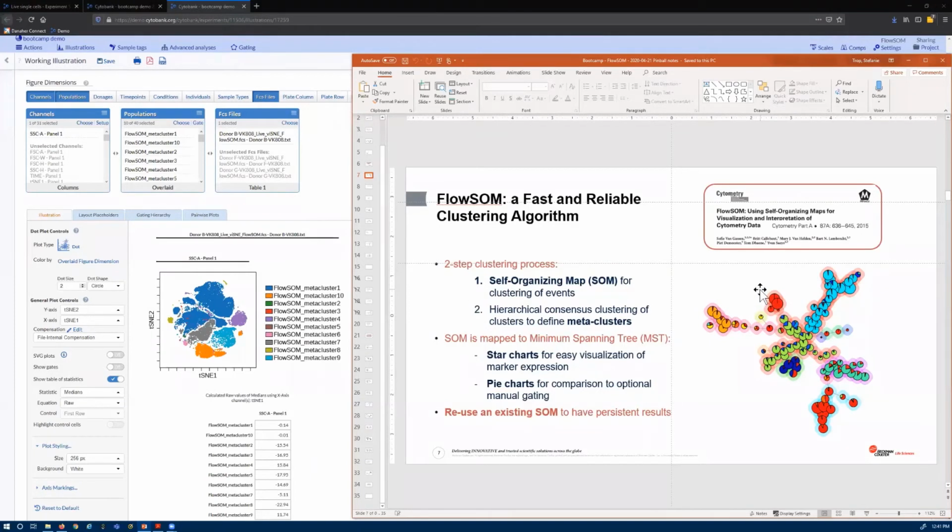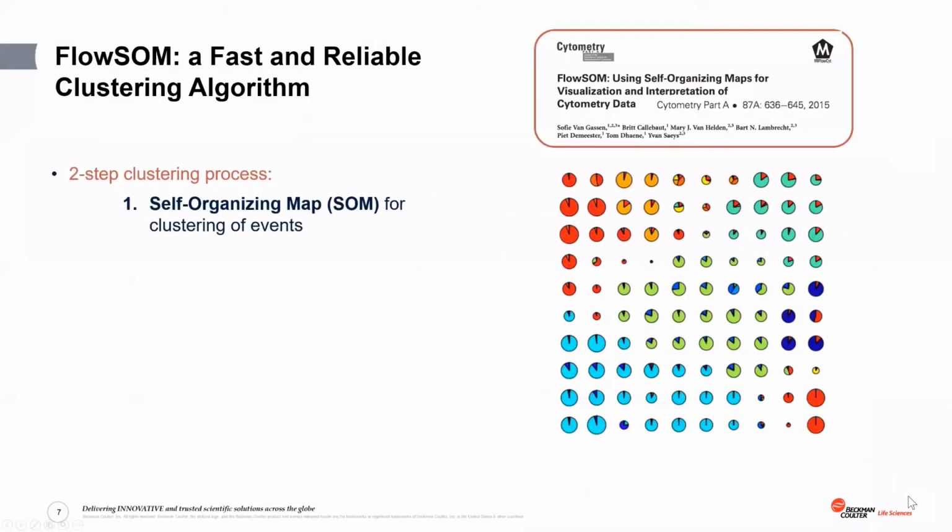So the cluster number is how many of those you tell the algorithm to divide your data into. And with FlowSOM, it's built upon this grid right here, which means that this number has to be a square. And this is a setting that you set in your run from a drop-down menu of available options from 100 to 400 in Cytobank.